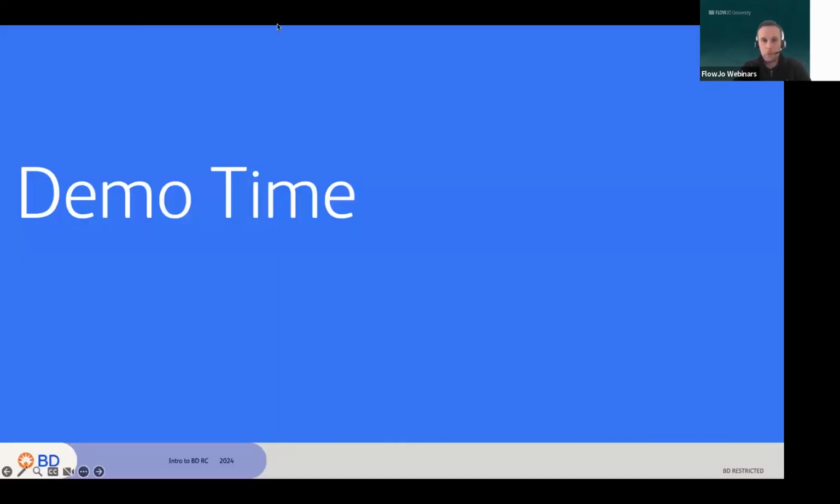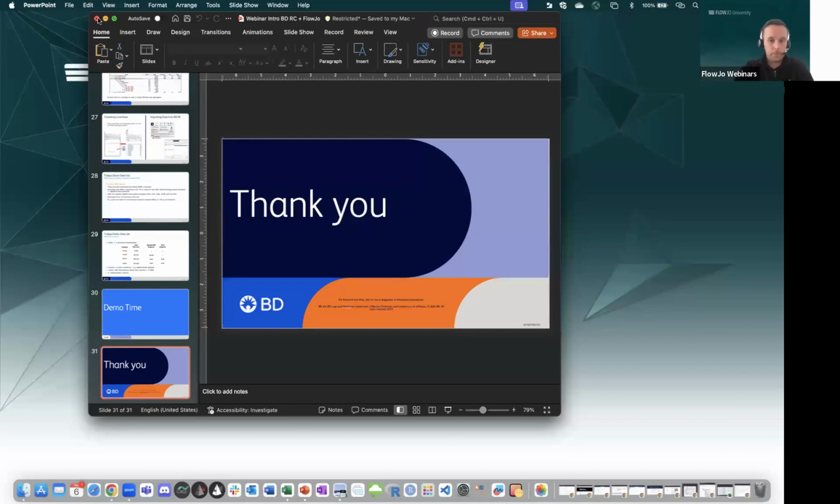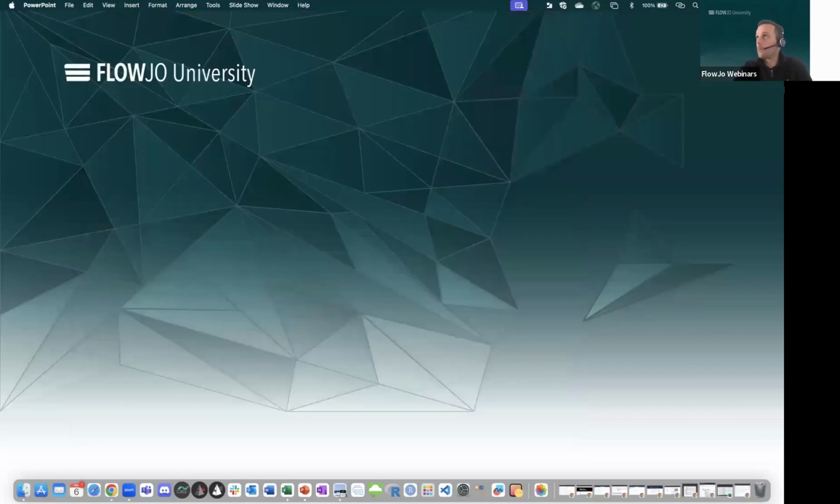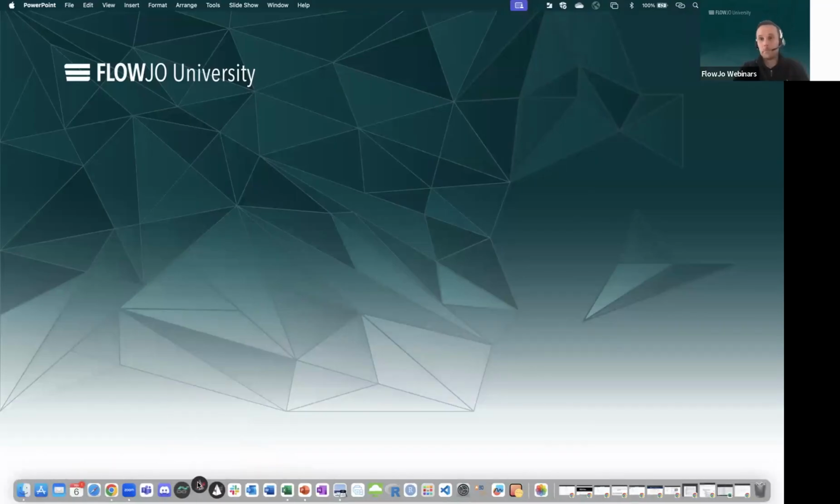All right, let's jump on the software and do this analysis. By the way, the chat is always open. Don't hesitate to put your Q&A there. Happy to answer any question live. So I'm going to open FlowJo 10.10.